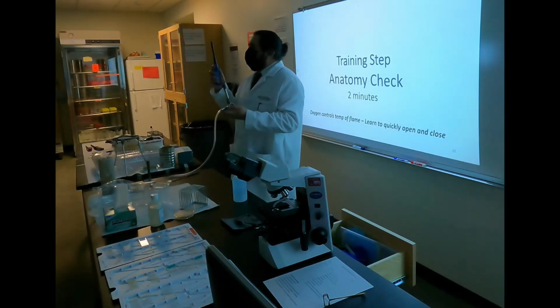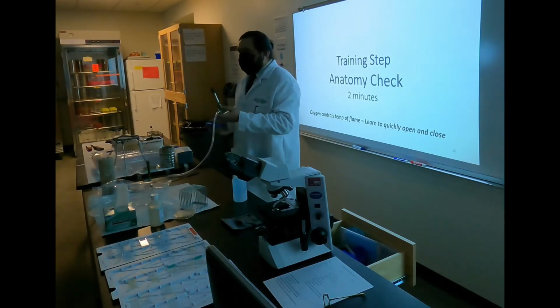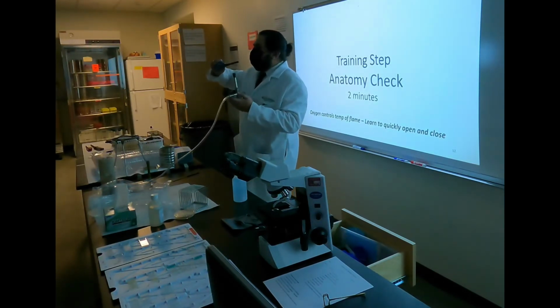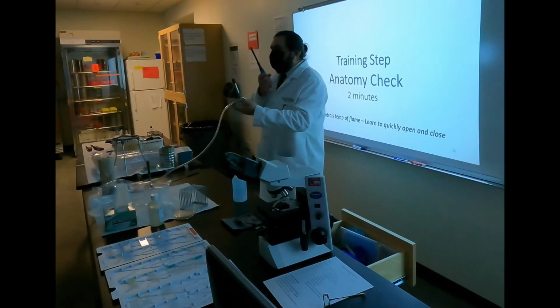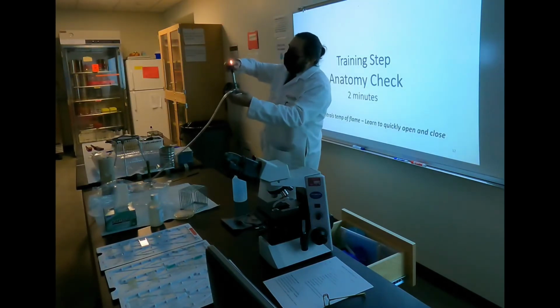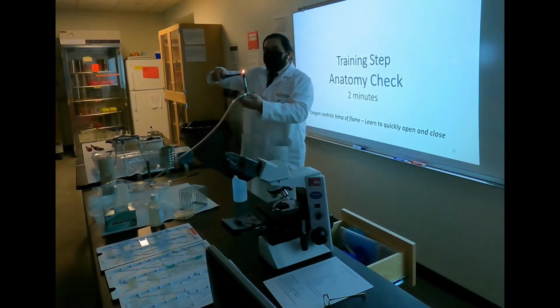And then we're going to practice this so we can get it in the first shot. We're going to be playing with our little wand lighters. Because there's gas flowing out from this, if you try to bring the flame and put it on top, it'll just blow it out, just like a flow of air, but it's a boatload of gas. So the trick is, rather than coming from the top, you come from an angle or from the side and then light it up. It's going to go perpendicular to this.